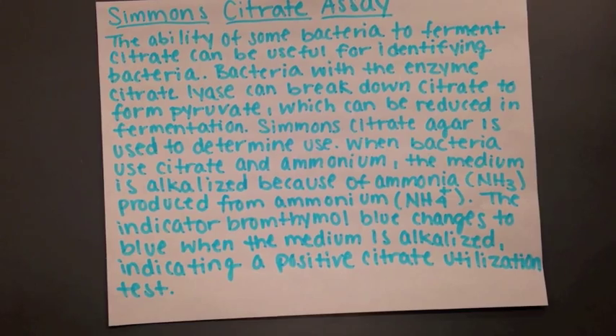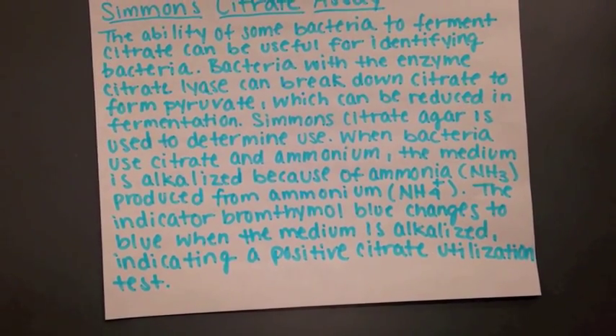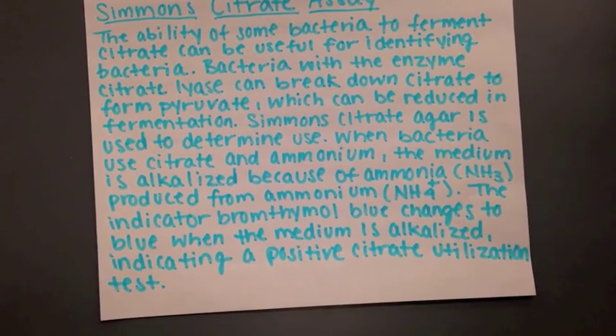The indicator, bromothymol blue, changes to blue when the medium is alkalized, indicating a positive citrate utilization test.